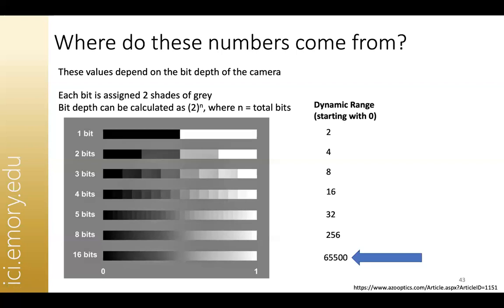Typically, in terms of images, when you are acquiring them on a microscope, you will have 3 different options: either 8-bit, 12-bit, or 16-bit. When you are on confocal microscopes, you will be getting either an 8-bit or a 12-bit image. When you are on a microscope with a detector, for example a camera, your options will be 8-bit or 16-bit, okay?